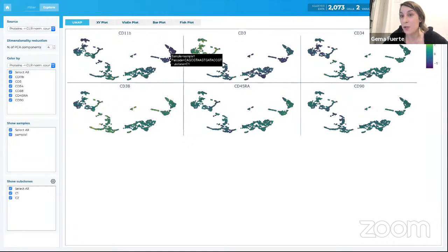the protein expression, we can perhaps go back and change the cluster number from k-means from 2 to 3 or to 4, and continue analyzing the data. Again, this is hypothesis driven, and you can change it based on the results that you're getting. For the sake of this demo, I will continue as it is, but I appreciate that you can see that this might be a potential subpopulation, which is CD11b negative within clone 1.